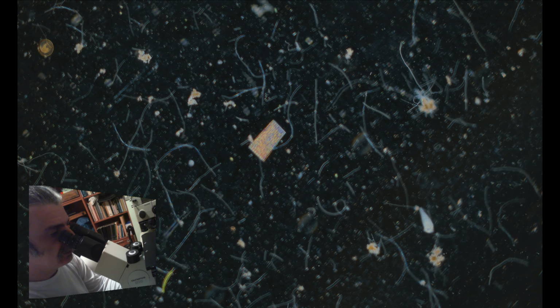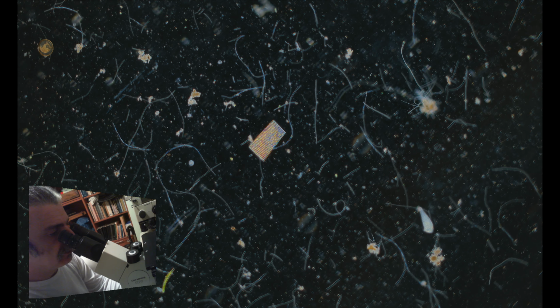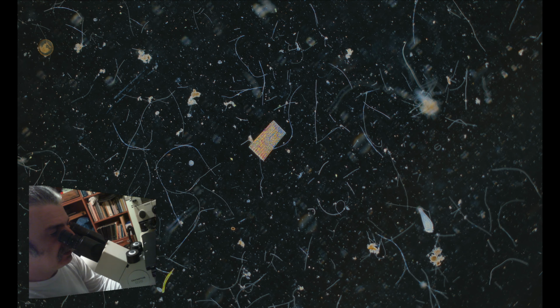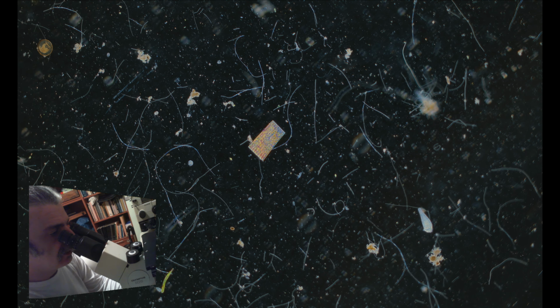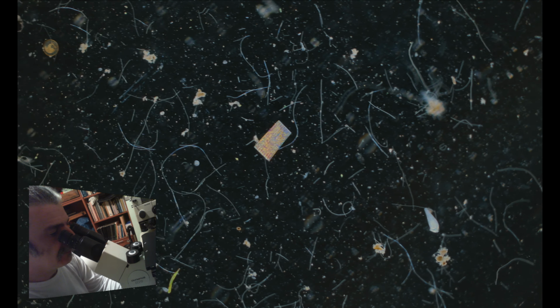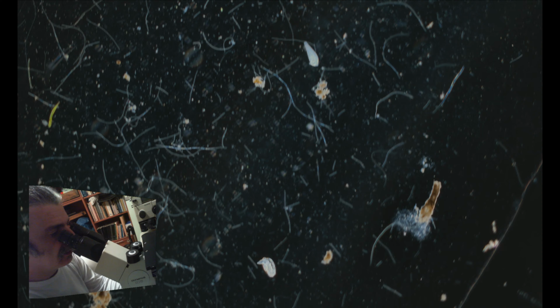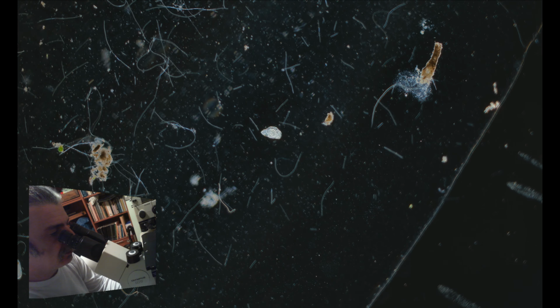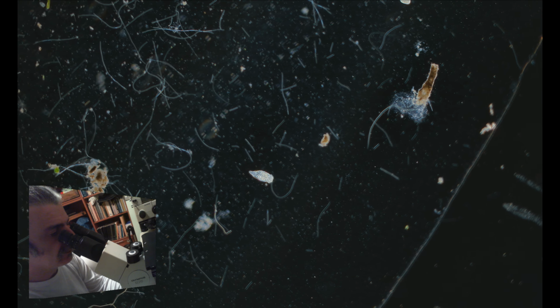Here's a diatom. Diatoms are algae that surround themselves with a glass protective layer. Here is another stentor, and this one is a rotifer, which is a multicellular creature.